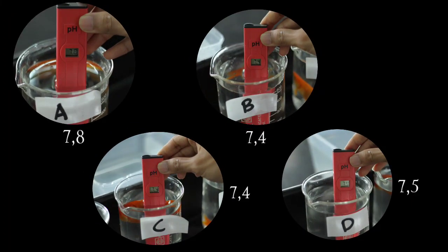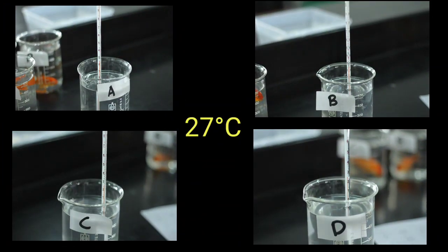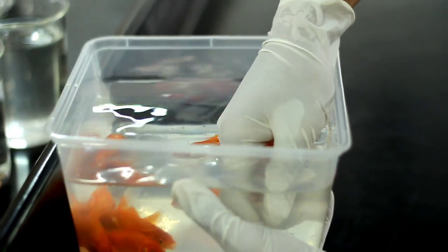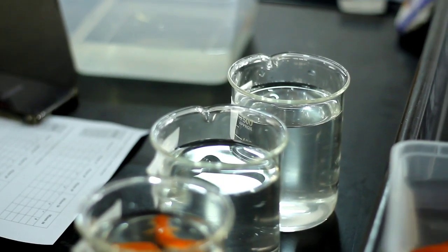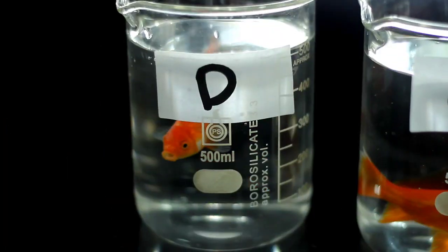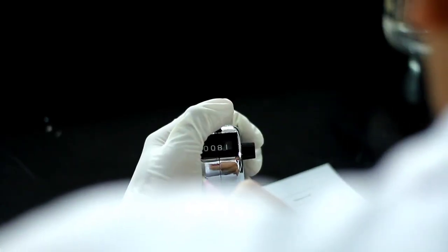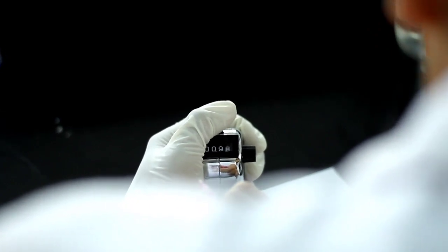The next step is to measure the pH and dissolved oxygen in each solution and record it on paper. Also measure the temperature with a thermometer, making sure the temperature is the same. The next step is to put one fish into each beaker glass. Then count the operculum movement and observe the fish activity for one minute. Repeat six times every five minutes.